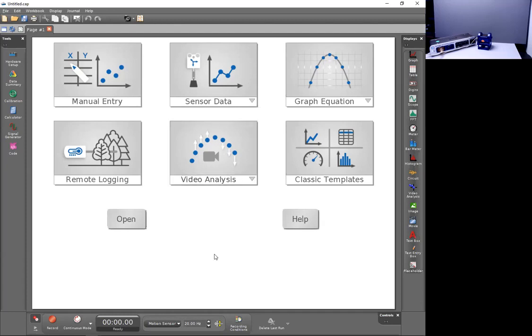And we currently have a one-page workbook. We can have multiple pages if our experiment gets a little more complex. Just like all applications on Windows and Mac computers, we have a traditional file menu system here. Here is Help. It leads to a dynamic online help, so I encourage you to take a look at that. And the most frequently used buttons from the file edit workbook menus also have their duplicates here as buttons for opening and saving files, etc.